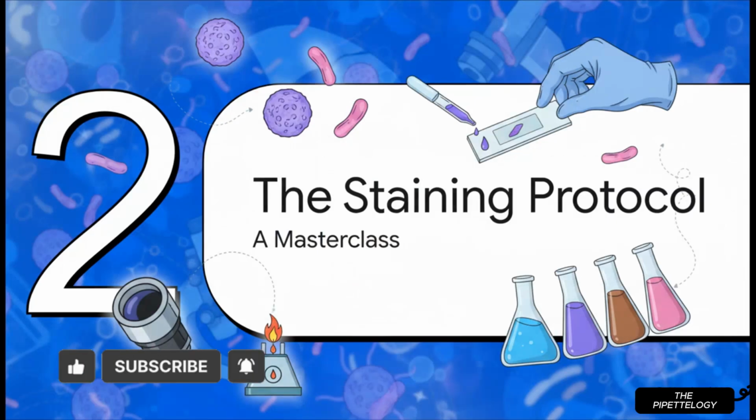Okay, so we've covered the why. Now let's get into the how. We're diving into the practical part of this masterclass, the actual step-by-step staining protocol. And trust me, this is where your precision and technique really, really matter.